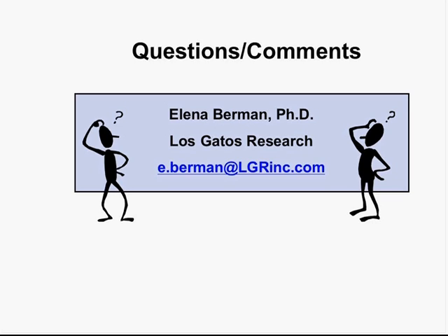Okay, Kate has a question, getting the mic. Thanks, Elena. So, quick question. At some point, you mentioned the flagging software will remove outliers in terms of injection volume. I was wondering if you could comment quickly on the concentration dependence of the analyzers and therefore how susceptible it is to the changes in injection volume.